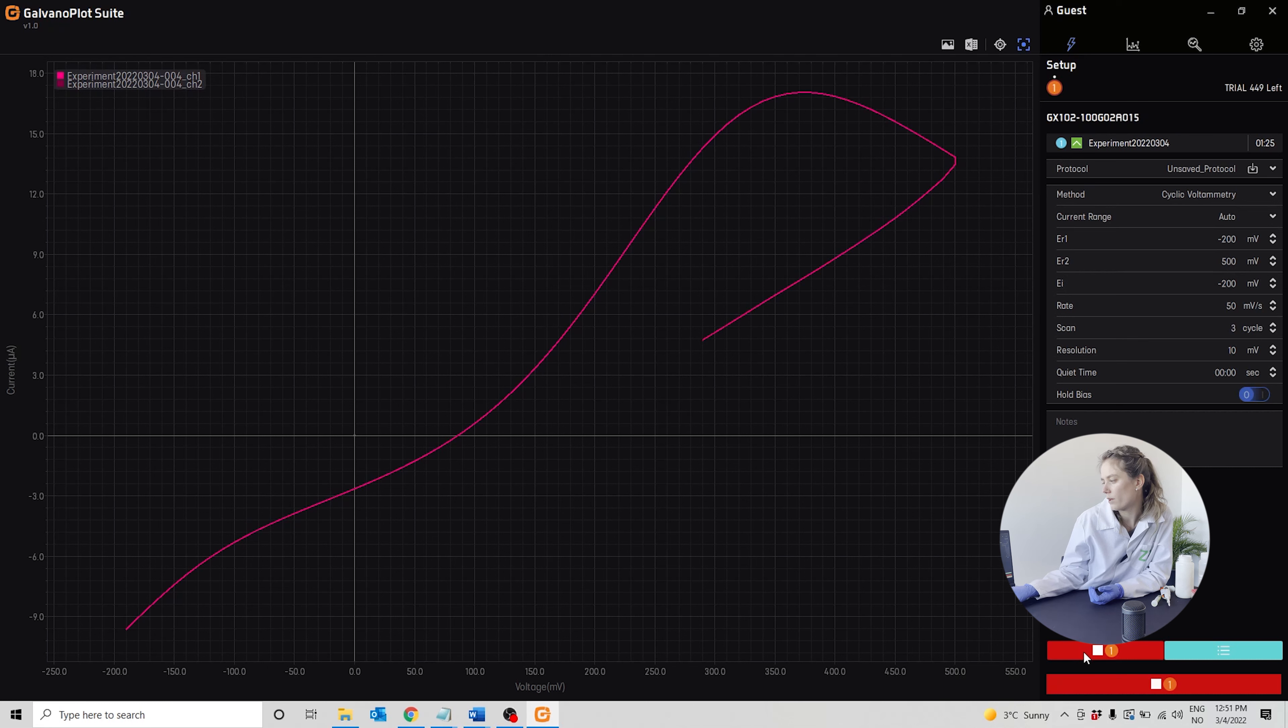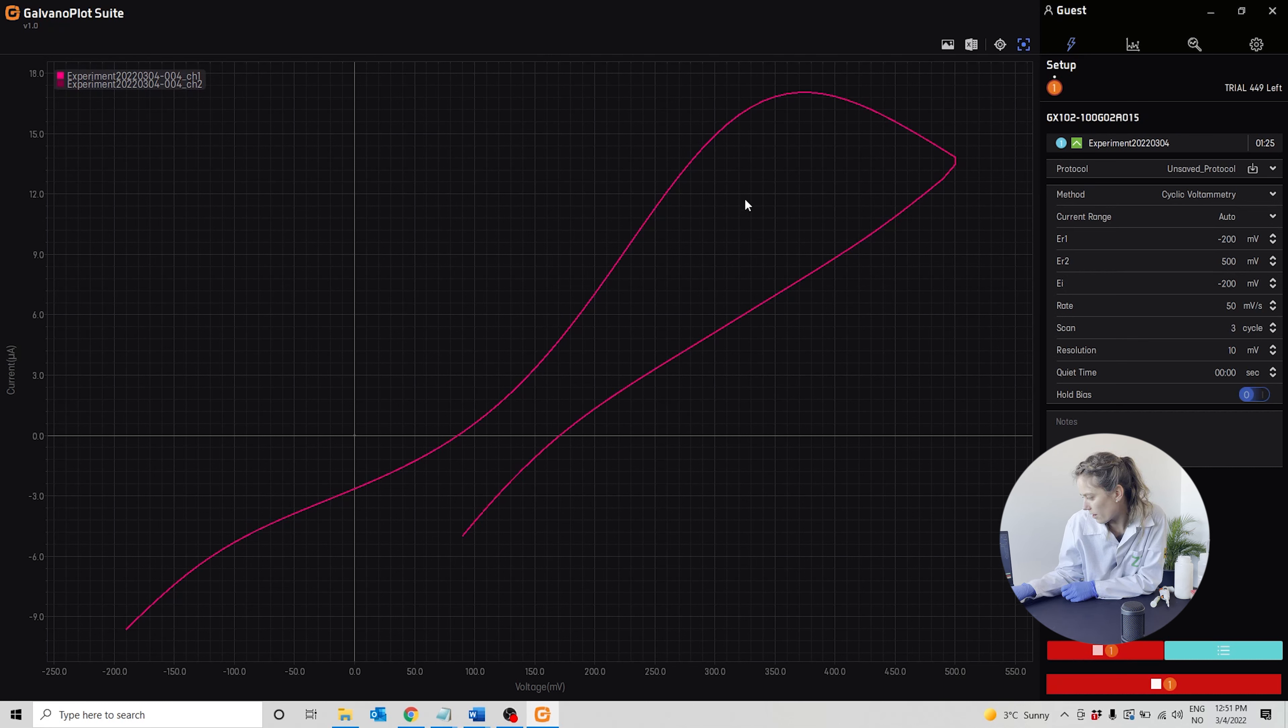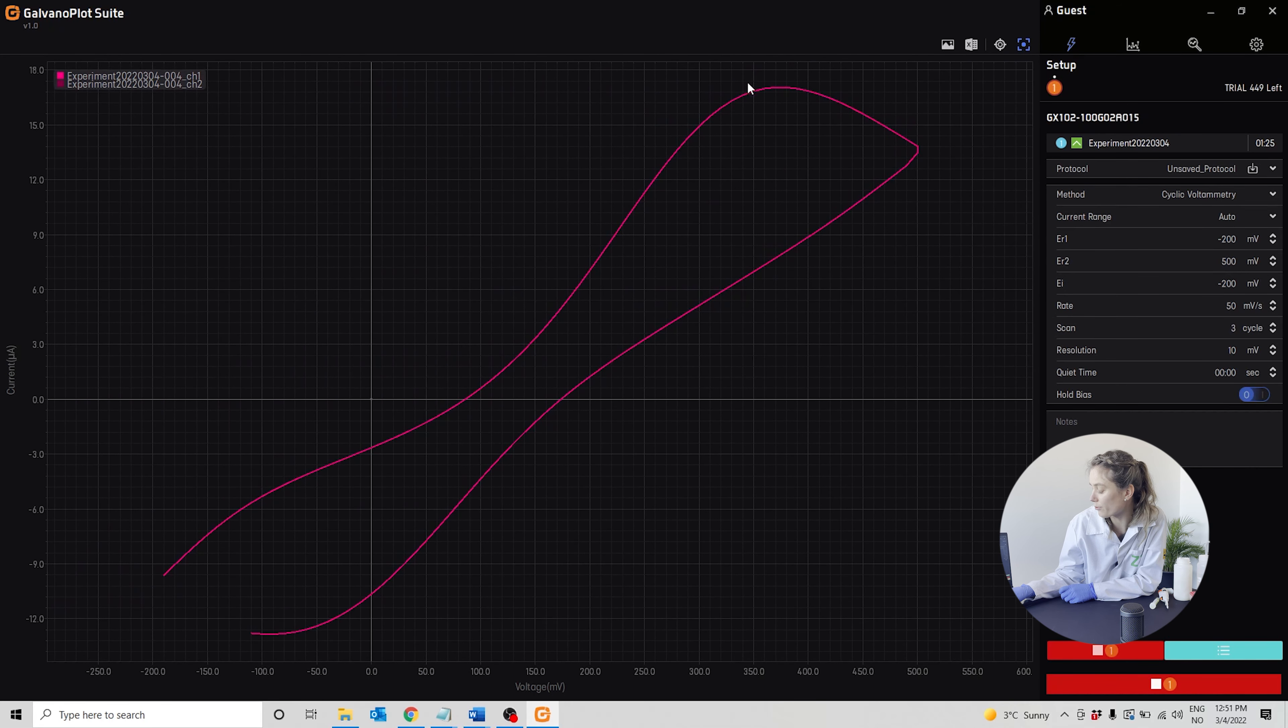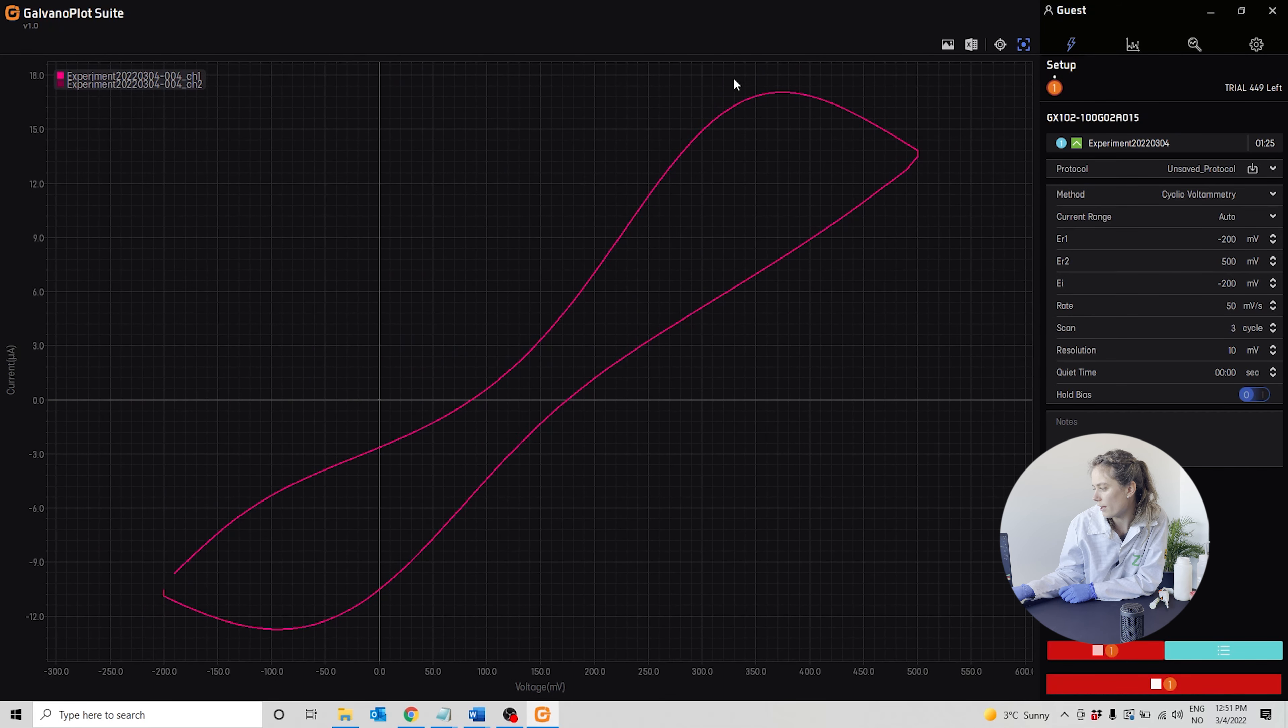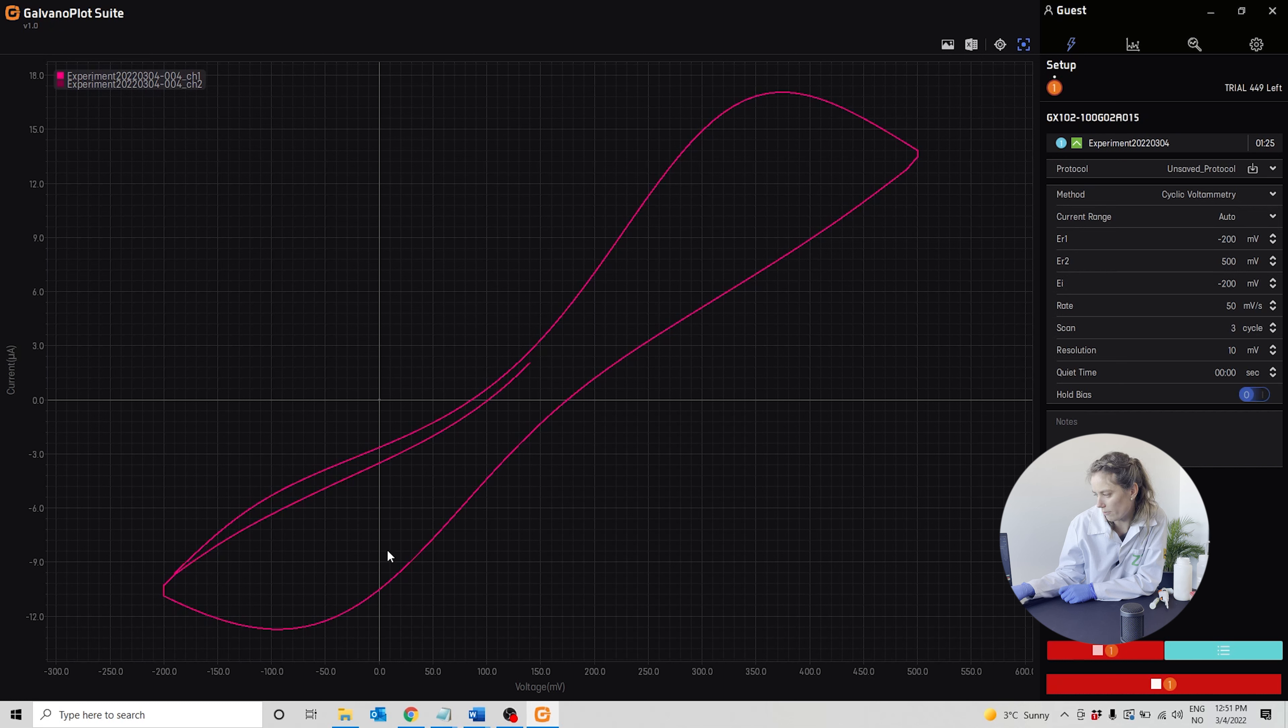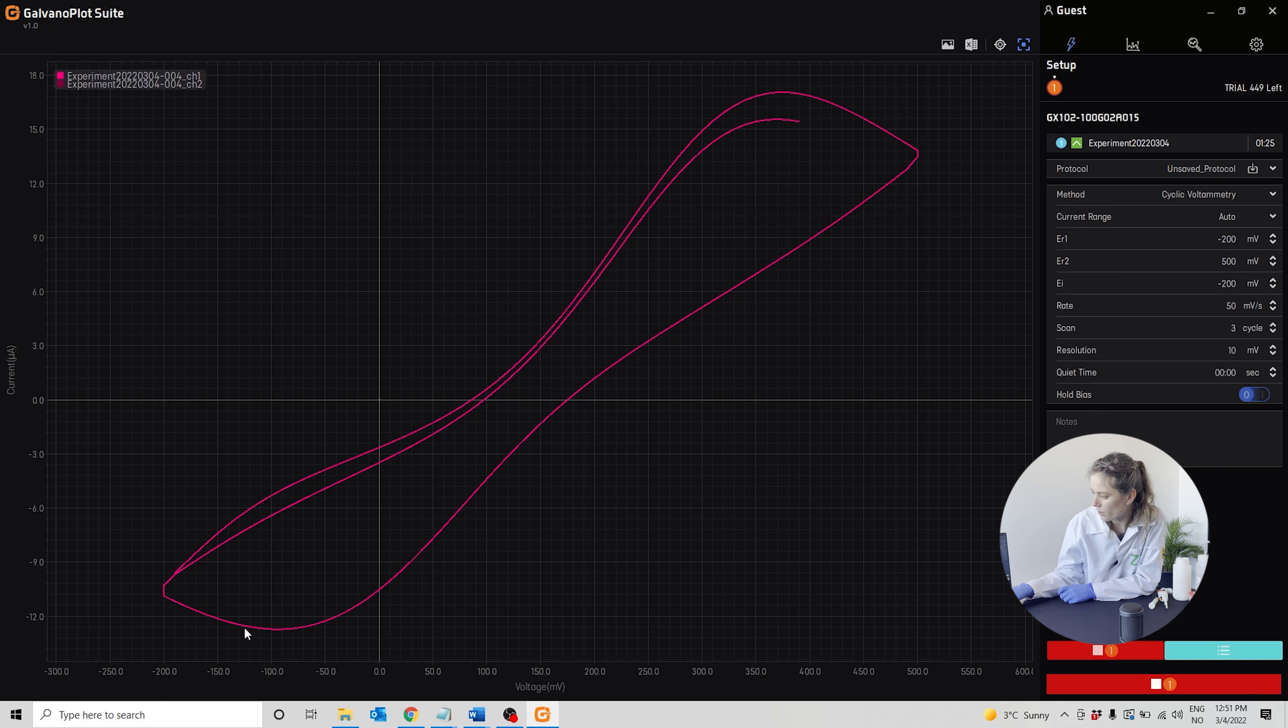In this curve you can see an oxidation peak around 400 millivolts, and then as it goes back down in potential, you see the reduction peak between 0 and 100 millivolts.